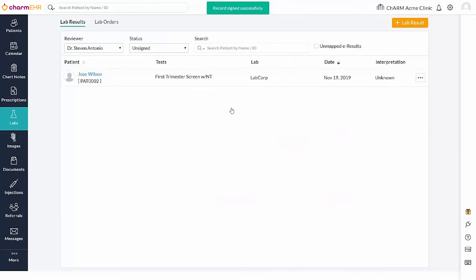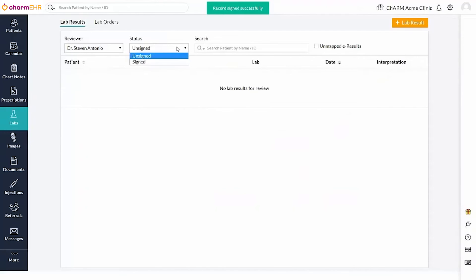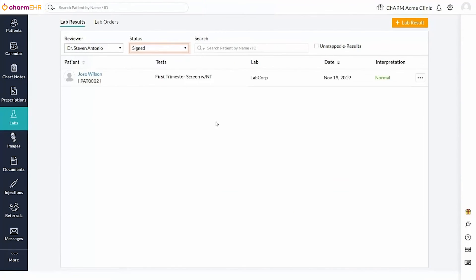You can easily locate all signed results by utilizing the Signed Results filter. The lab report can be downloaded using the Export as PDF option.